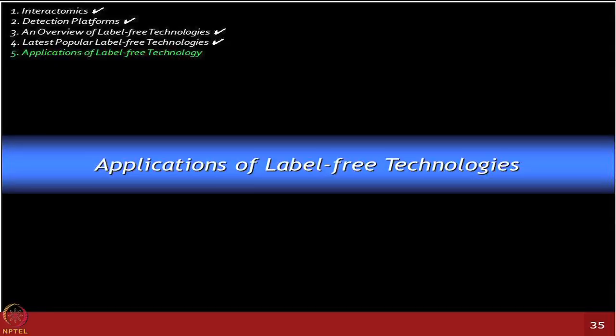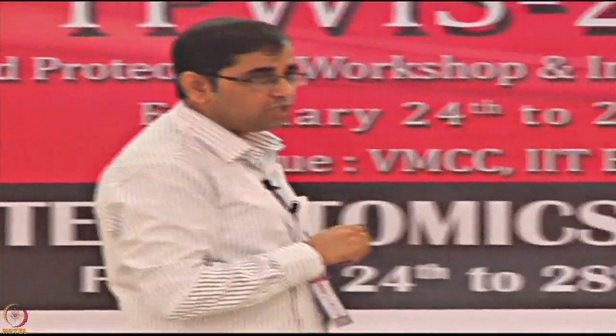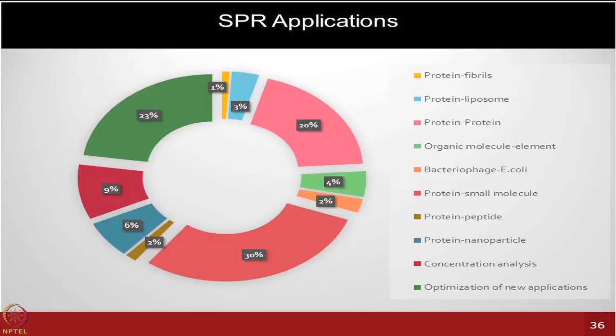I'm restricting the applications right now mainly to SPR, because that's what we currently have available at IIT Bombay. And I'm also running a core facility which offers services for many types of applications for internal users and external users. This particular distribution shows you that we are doing all kinds of applications here, from protein fibril interactions, protein liposomes, protein protein, to various organic molecules.